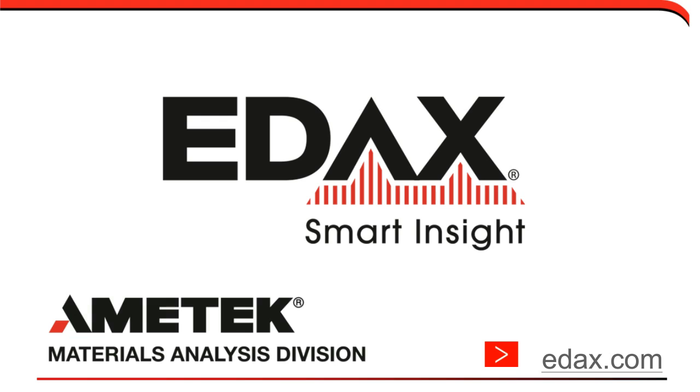One, you can run your software with no background at all and then create different backgrounds for each phase or whatever, or you can start with a basic background and then adapt as you want, if one phase doesn't work or the other. I think the most important thing is there's a lot of flexibility built in to address the different challenges, and your best approach depends on your material. If you have a material where 80-90% is one phase and 10-20% is the other, I may take one approach, where if it's more 50-50, I'd take a different one, or if it's 30-30-30, I might take a different one. It has the flexibility to address all of those.